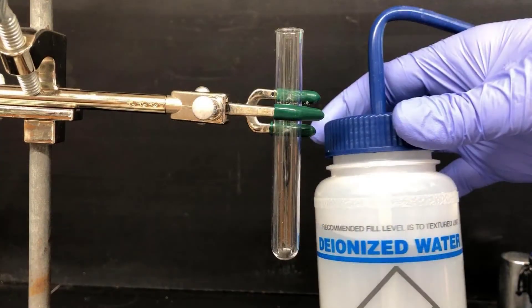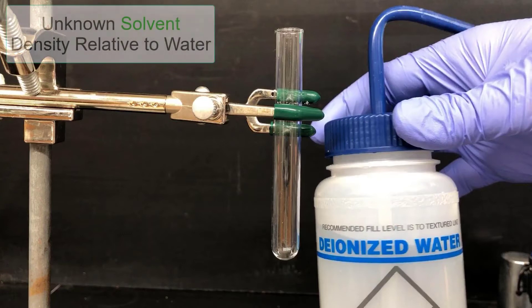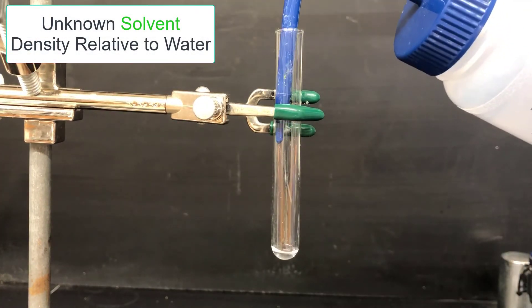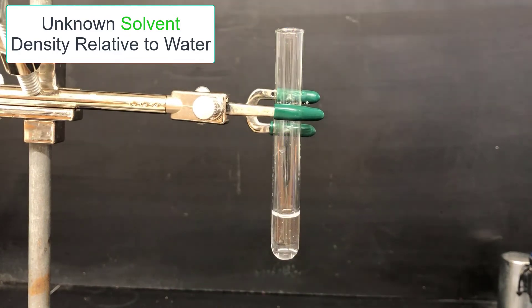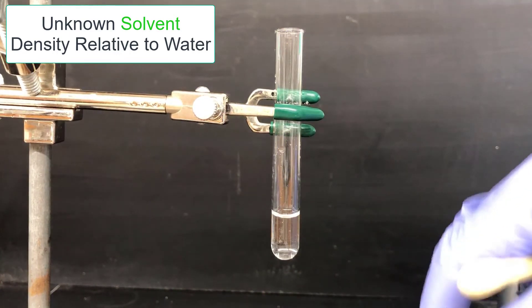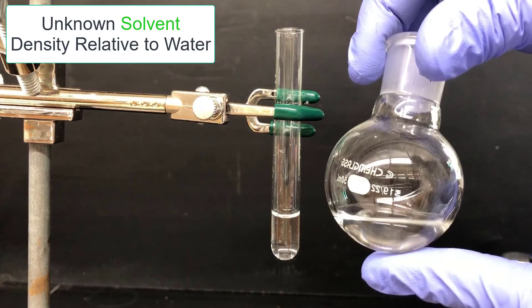Now I'm going to continue to work on identifying the solvent. I'll start by its density relative to water. Here I have some deionized water and I'm going to put that in a test tube and clamp it to a ring stand. Then I'll take a little bit of my unknown solvent and I'll add it to this test tube and see if it sinks or floats.